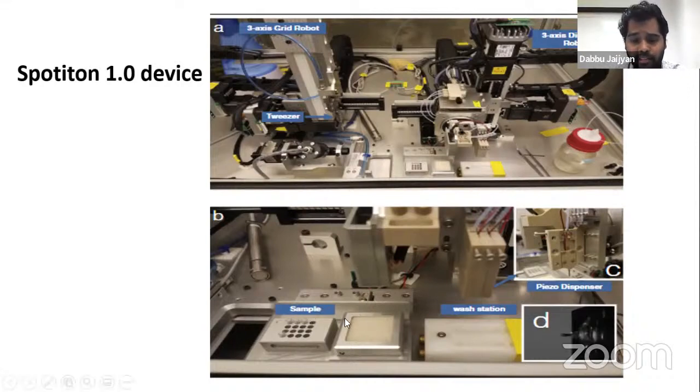So the same thing here, this is just a picture showing that we have the samples over here. This is the wash station, and this is the dryer to dry those tips, and then it will deposit or dispense the sample over the grid, which can also be moved in 3 directions. And this piezo tips station can be moved in 3 directions. Once the sample is deposited, it will be vitrified in liquid ethane. And then from there, the grid will be automatically transferred to the grid box in liquid nitrogen. So I will come to this method.